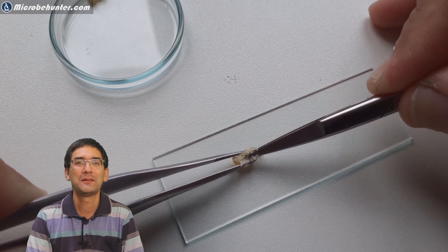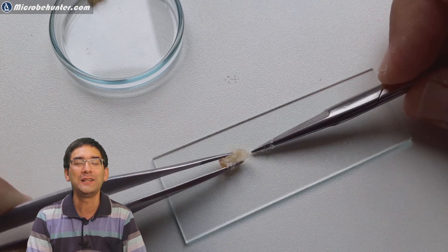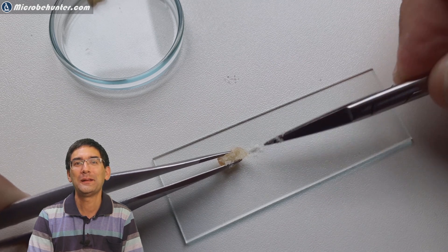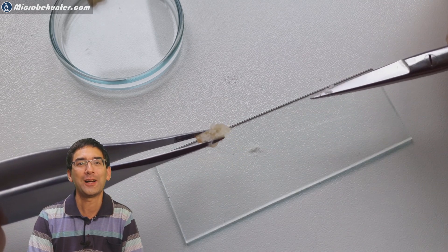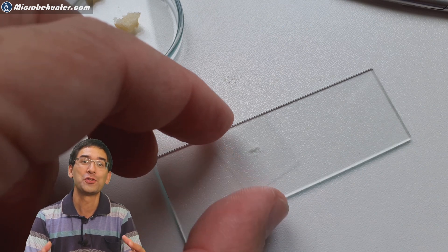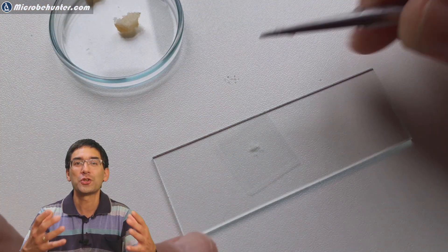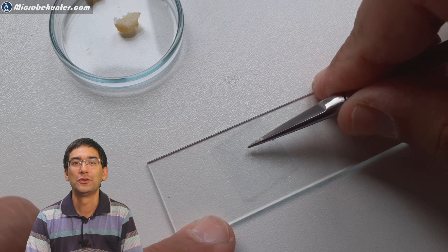I did not add any water yet, but then again did an iodine reaction with that. I could, as expected, see that the starch started to turn black due to the reaction.